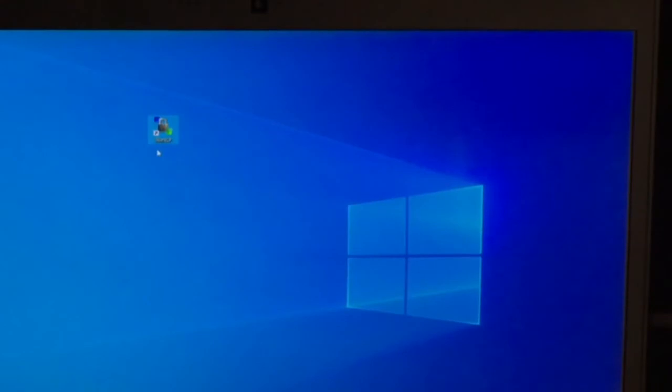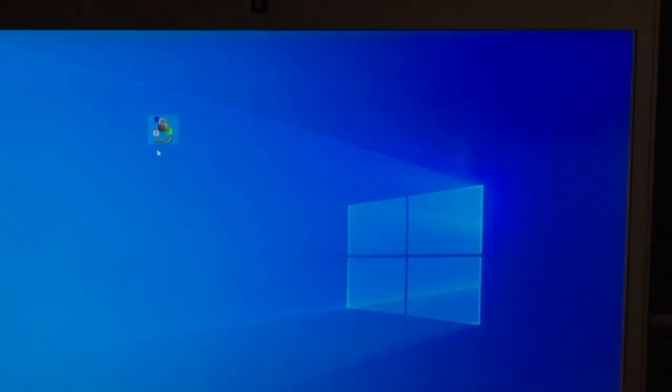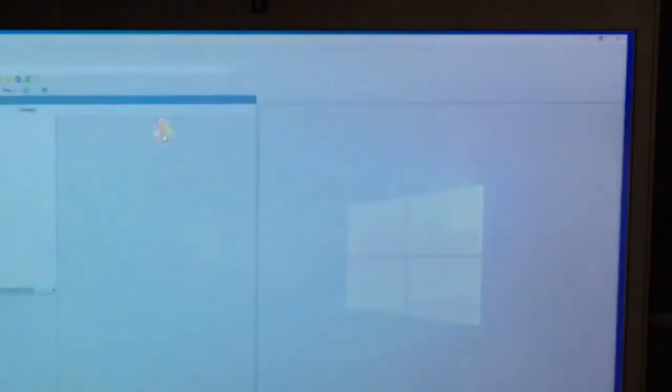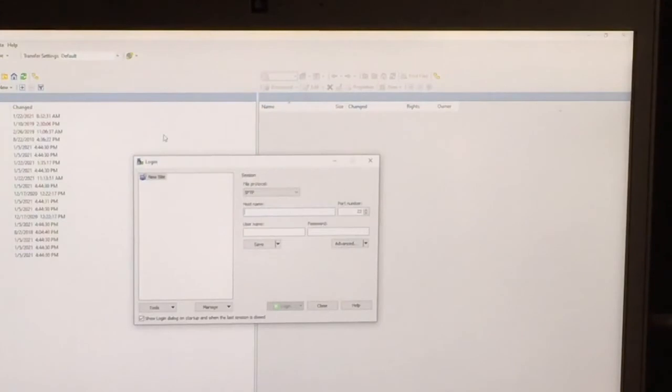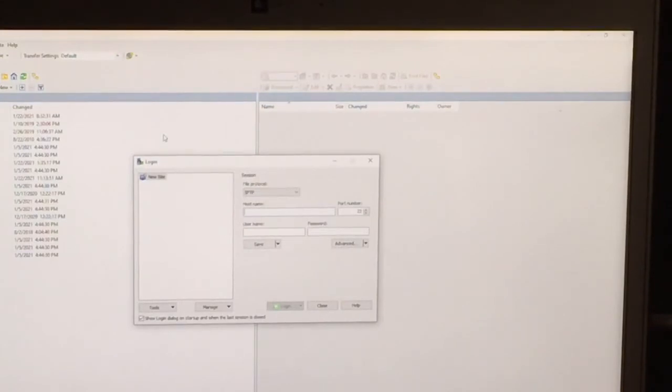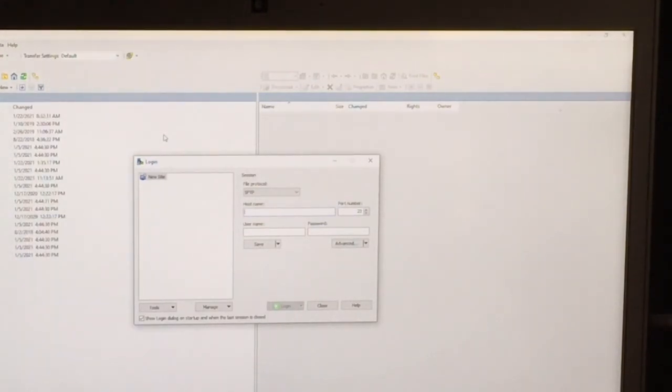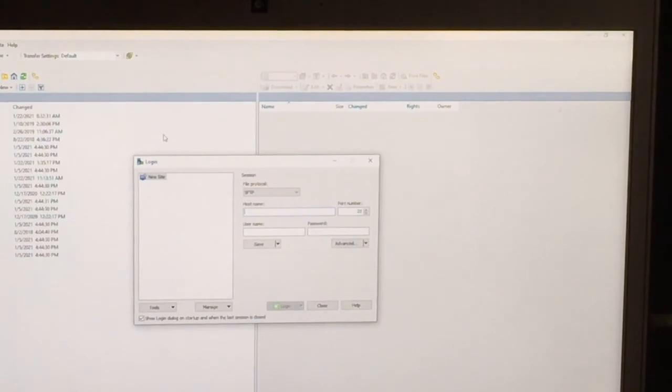Alternatively, instead of using an Explorer window, you can use a free application software, which is called WinSCP, as shown here. WinSCP is a software that supports SFTP, which is a safe file transfer protocol.